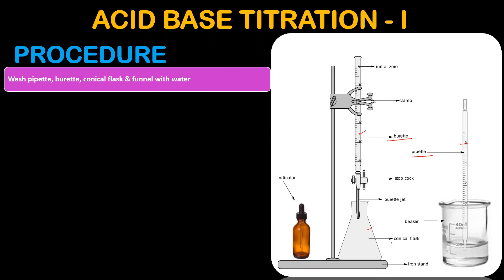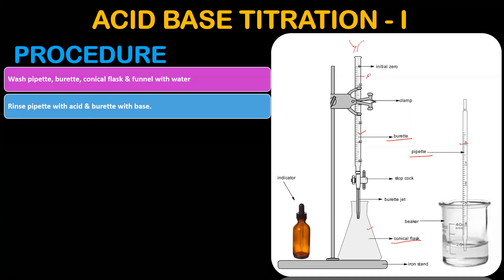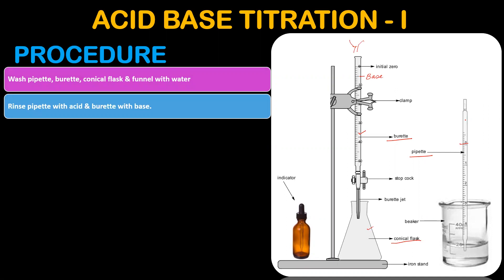The fourth apparatus is called a funnel. To fill the burette, first wash these four pieces of apparatus, then rinse them. You know that the base will fill the burette. You have to rinse it using the burette ear to rinse it properly.